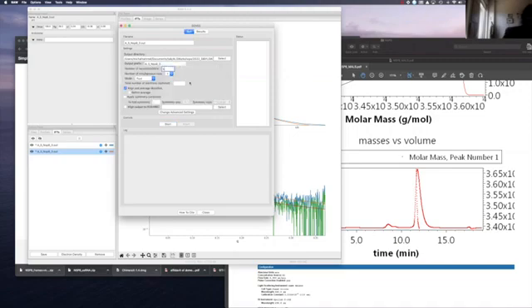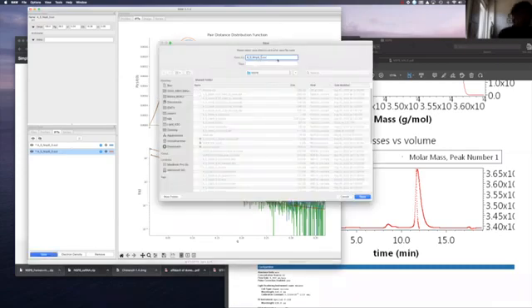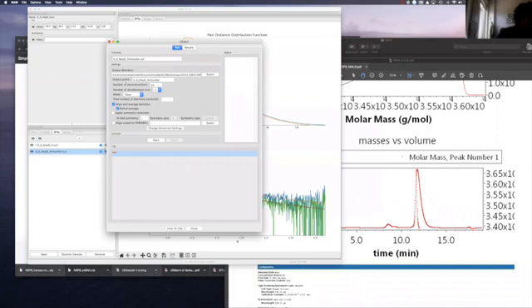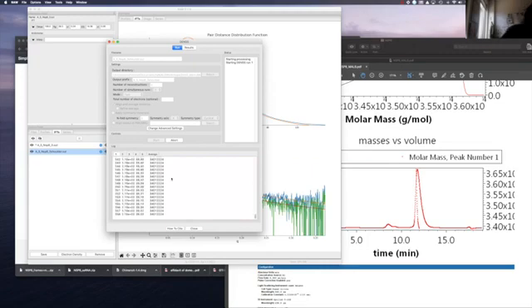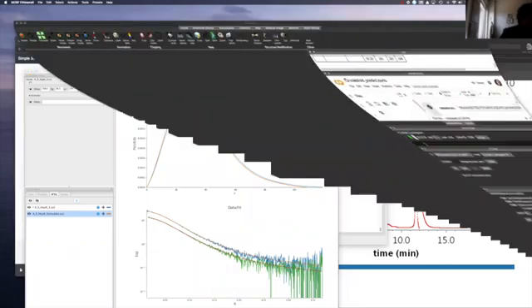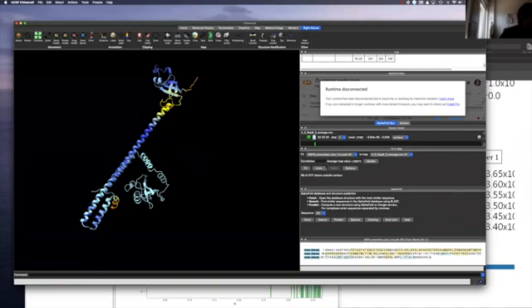Okay, so now I will change this name. Sorry, I need to change the name here. Okay. And now, I'm sorry, we just do 5 models, in a fast mode, no refinement, just a version. And it's done. So in this fast mode it's going to take about 5 minutes. I did it before, and we'll just fire up Chimera. Okay, kind of ignore what is here. Already done.